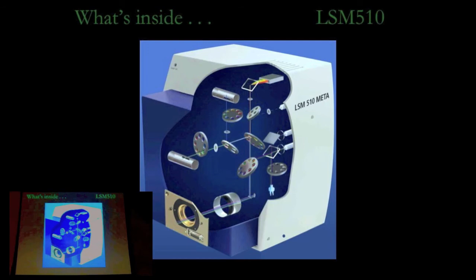The size of the pinhole: you can set the pinhole to match the point spread function of the objective, so that you're collecting at the diffraction limit, or you can open it up a little bit more and collect over a thicker Z slice and get more signal that way. So you can sacrifice some Z resolution and a slight amount of XY resolution to increase your sensitivity. So Z is really the main influence of the pinhole. Gotcha. Opening the pinhole up is going to increase your optical section thickness.